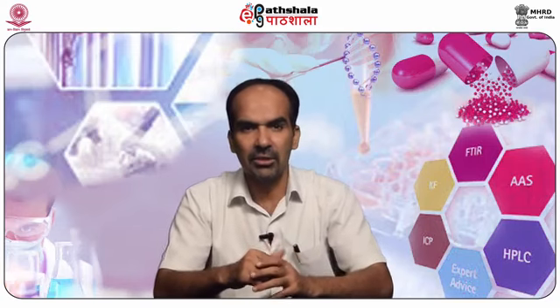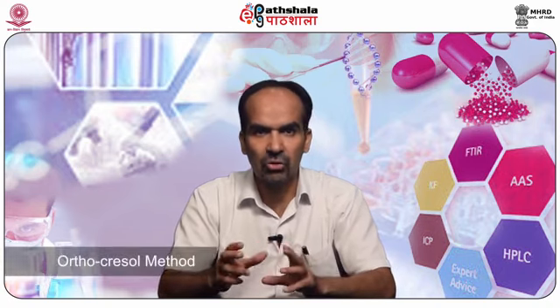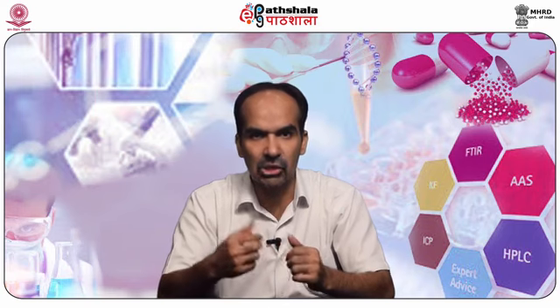Let's now understand the determination of cineol in volatile oils. The content of cineol in eucalyptus oil and cajuput oil is determined by the orthocresol method, which depends upon the lowering of the freezing point of a mixture of cineol and orthocresol, which is proportional to the cineol content in the oil. The method is particularly accurate when the cineol content in the oil is above 50%.